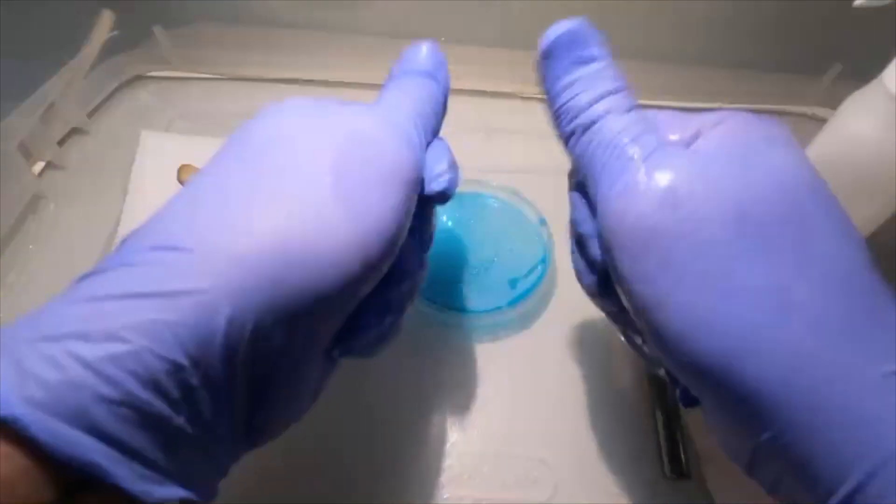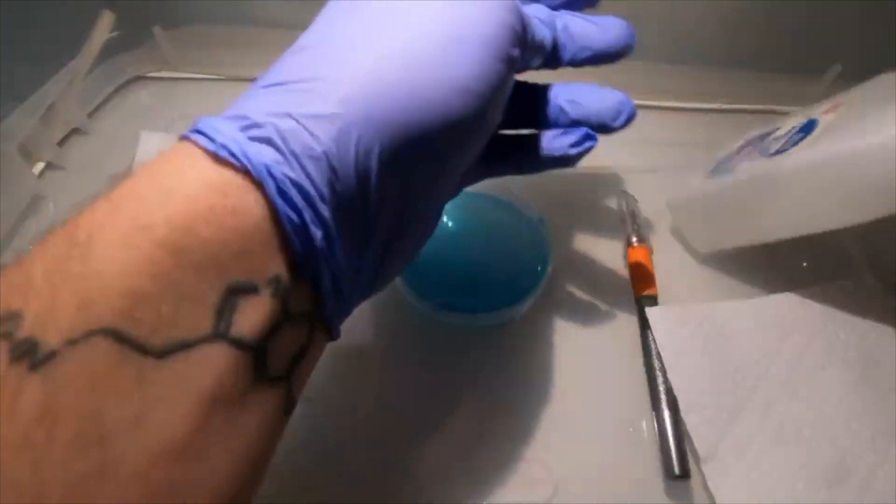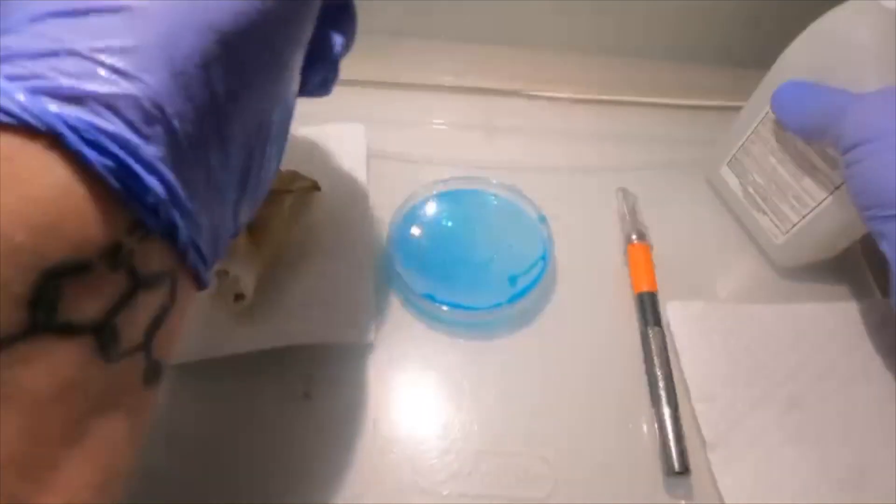As always, make sure you do this in front of a flow hood or inside of a still airbox. The first thing you want to do is wipe down everything with the rubbing alcohol, including the mushroom.